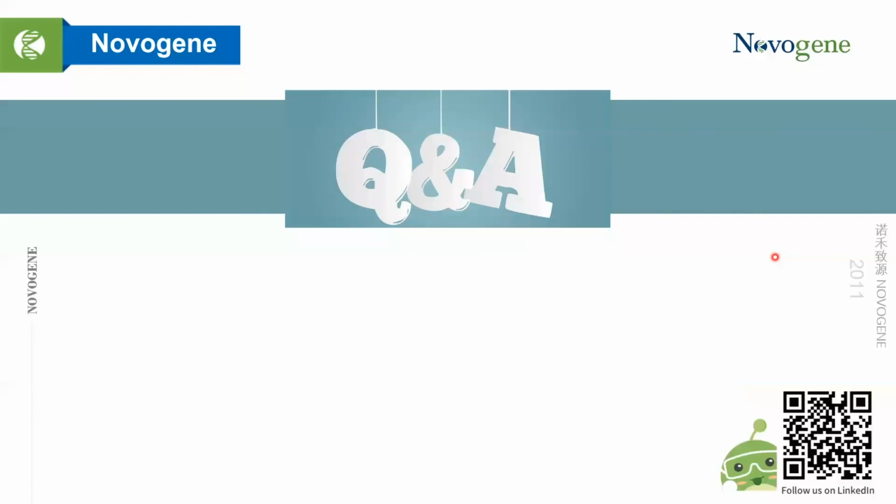And the next question is going to be this one. This is a bioinformatic question about the mapping rate and variation quality, which could be vitally important for subsequent advanced analysis, so I would like to answer it and share with you. This audience member asked, while mapping rate affects variation quality, could you please list the potential causes of a low mapping rate?